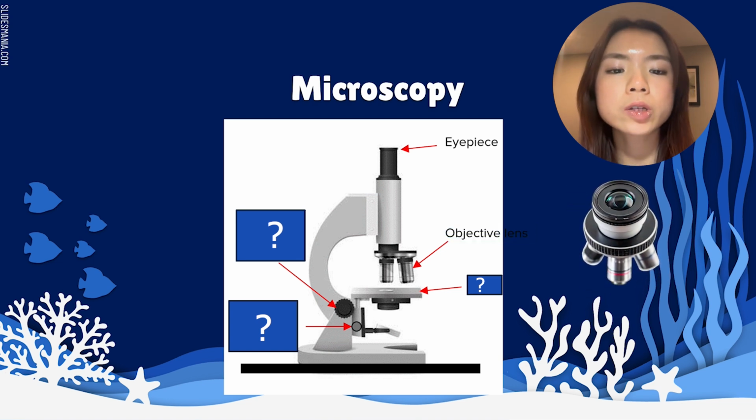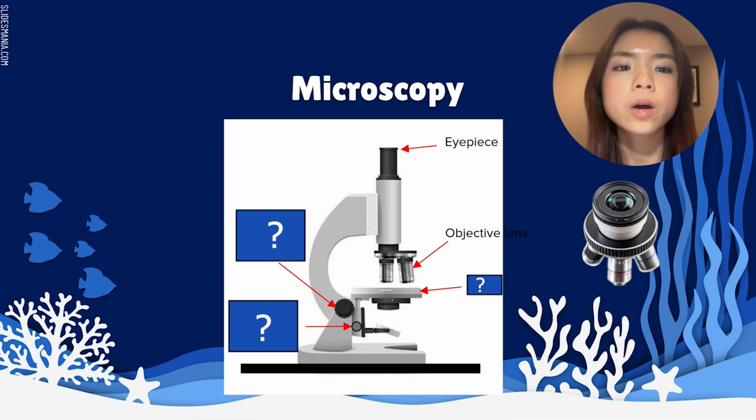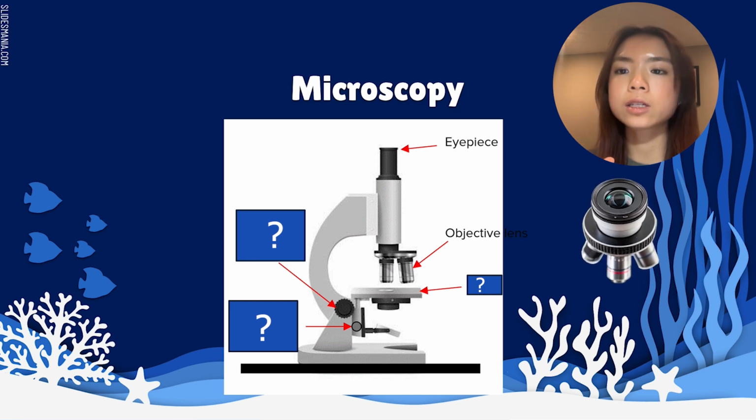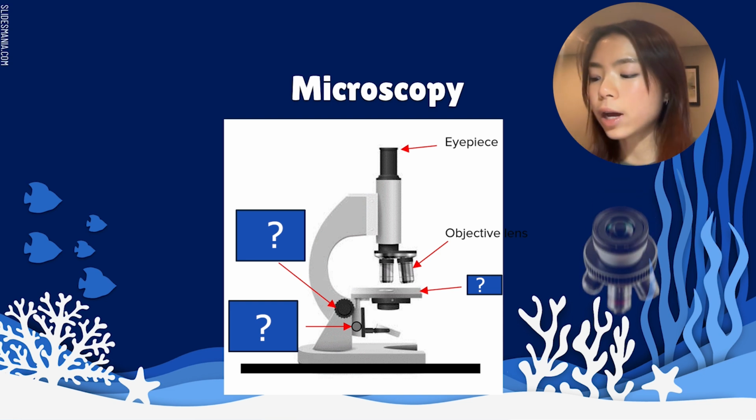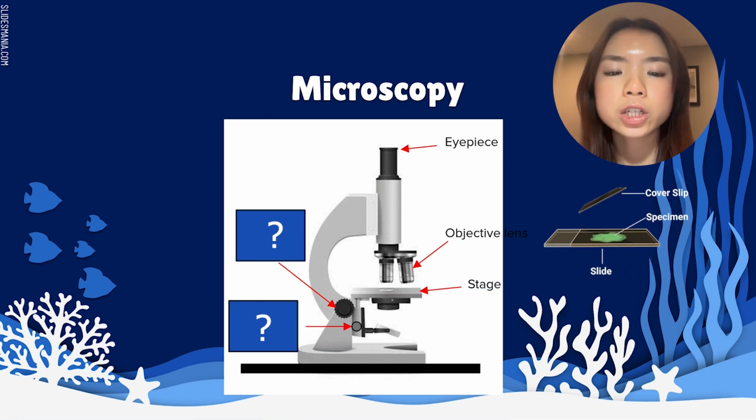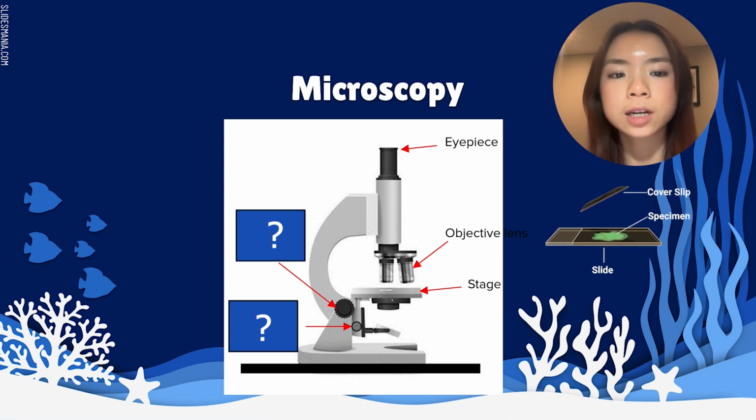These are responsible for magnifying the image, and there are different objective lenses with 3 different strengths of magnification. Normally in class, you might have used it where you twist it round. Then below that, we've got the stage. The stage is where we clip our microscope slide, whatever specimen it is that we're trying to study, and we're holding it in place.